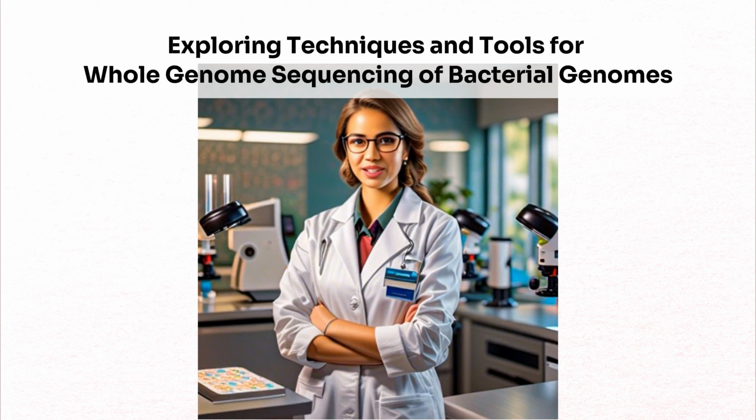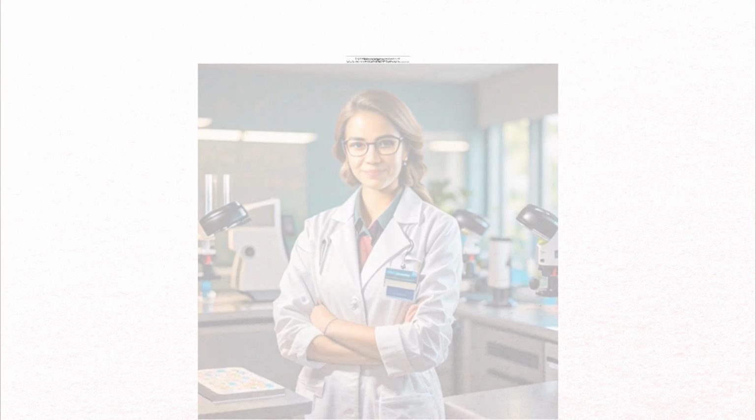used for species identification, MLST typing, and detecting resistance genes in bacterial genomes. Through this demonstration, we'll highlight how these tools empower researchers to accurately characterize bacterial species, track their evolutionary paths, and uncover crucial insights into antibiotic resistance.